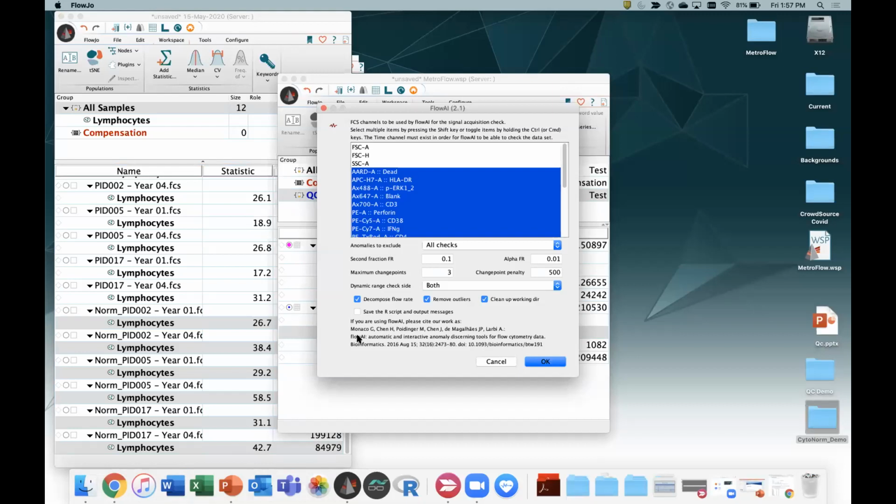Okay, so good questions. There will be some amount of difference in time on how long it takes to run, but it's probably not appreciable. The algorithm itself runs fairly quickly. It runs something like 20 seconds on 500,000 events, 8 to 10 parameters. So maybe if your variability is 19 seconds or 20 seconds, it's probably not something you perceive. So no worries about that. If it's all the same to you, just run them all.